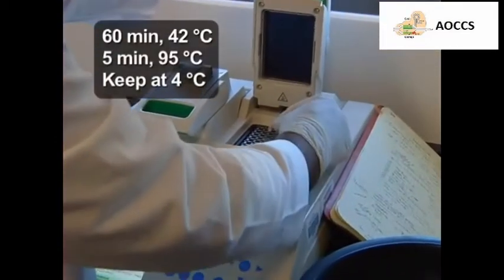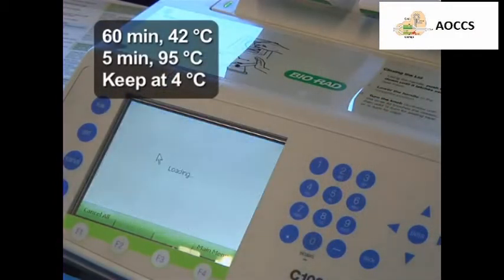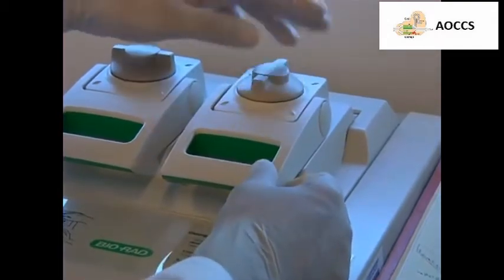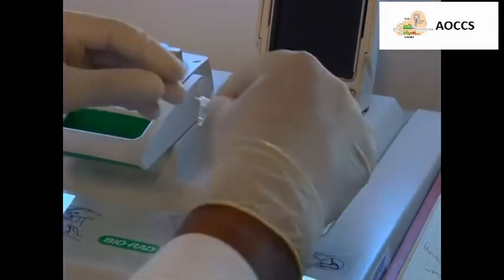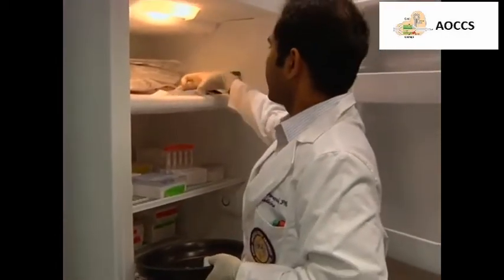Place the sample in the PCR machine and enter the settings shown here. Then, start the program. Following retro-transcription, the cDNA is ready for real-time PCR amplification and can be stored at negative 20 degrees Celsius for up to 5 weeks.